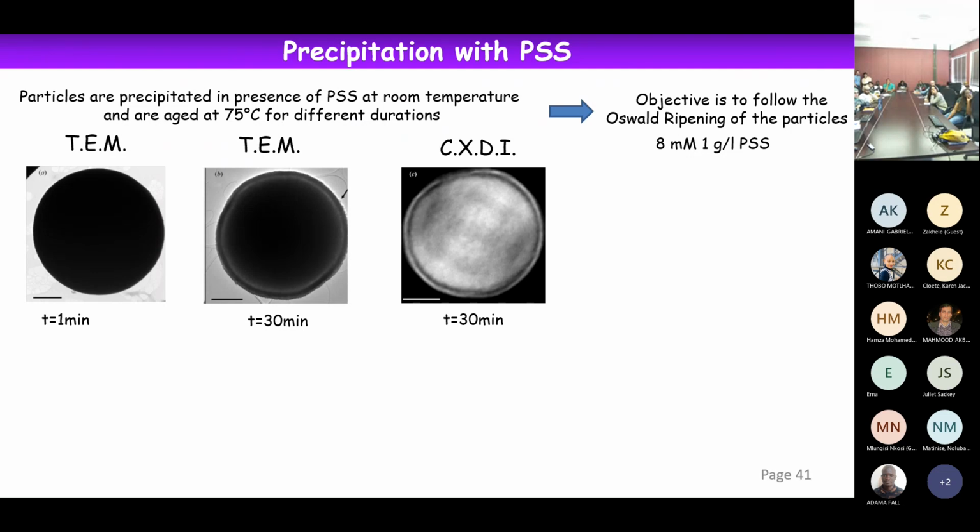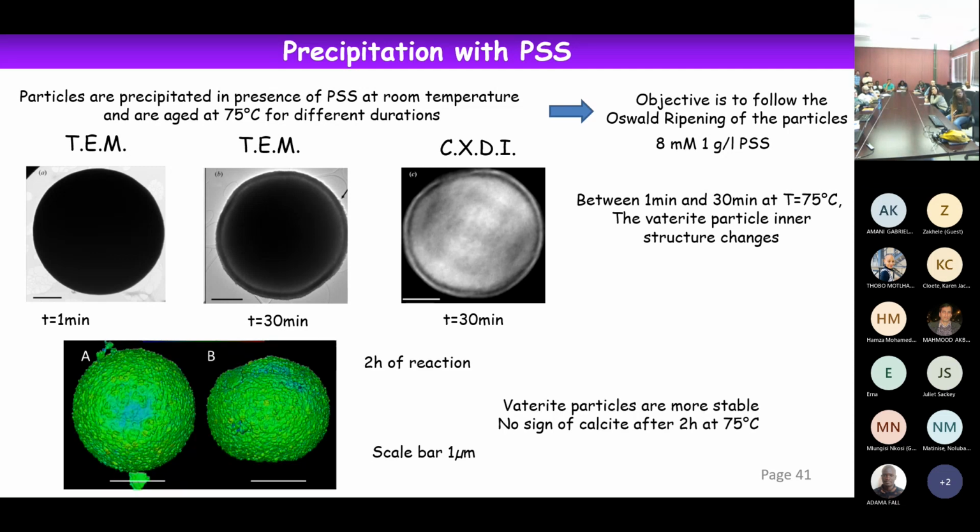That's challenging. Yeah. So let us compare two things which are comparable, those two ones. You see, it's fully black here, but in this case, it's not really fully black. And what you can see is that there is a white part. Okay. And here in X-rays, it's white here. Now it's black here and white on the crest. So it means that you have formed here something which is no more homogeneous in terms of density.